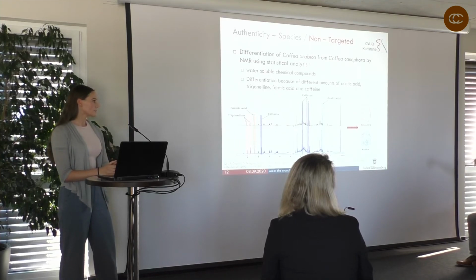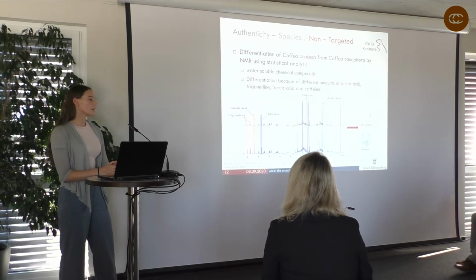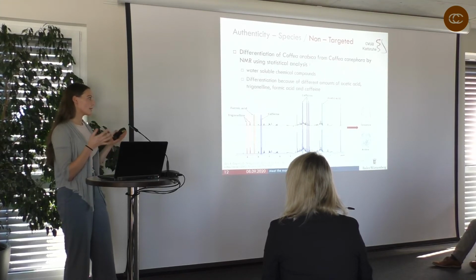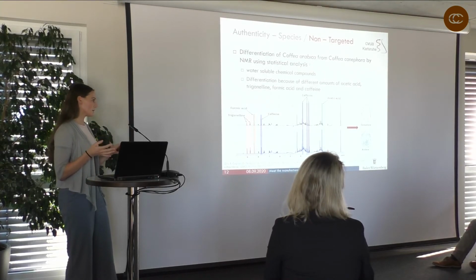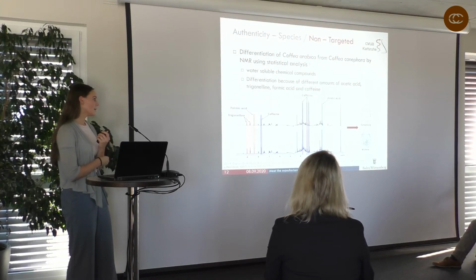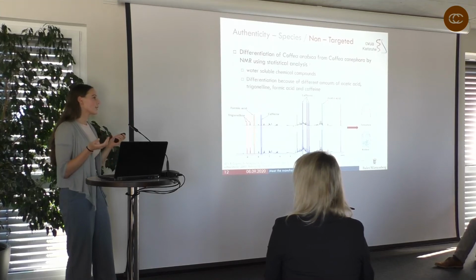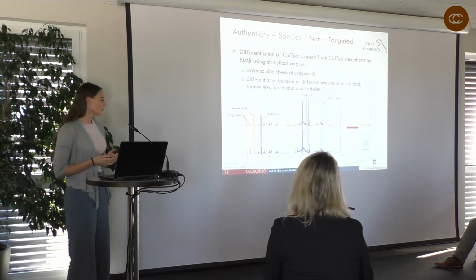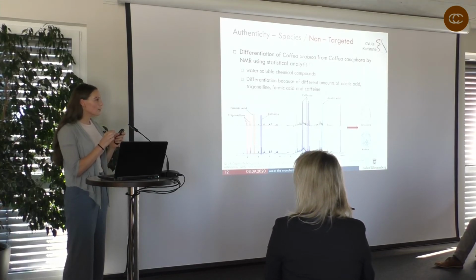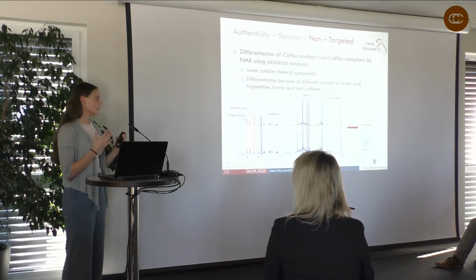Just as I have the same problem with polymers. So if I wouldn't have a good library, then... So the statistic is responsible for the separation. So the substance has more than this one peak? Yeah. It is like every hydrogen of the substance can produce a signal. But like Herr Lachmeier said, it is often like a very small peak and you can't really differentiate with your human eye.